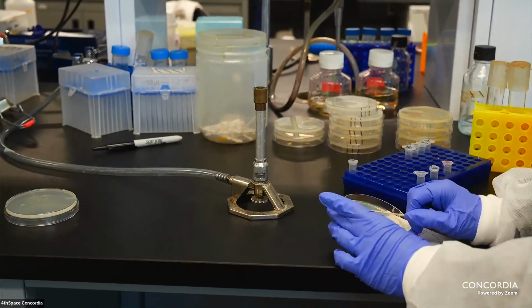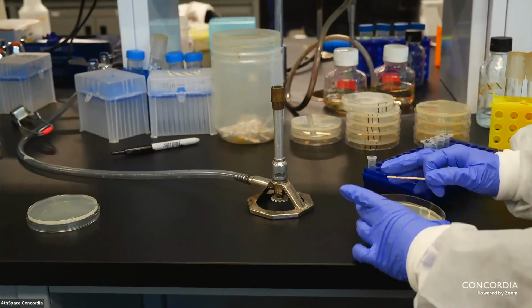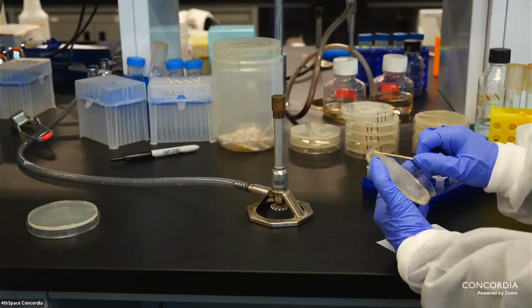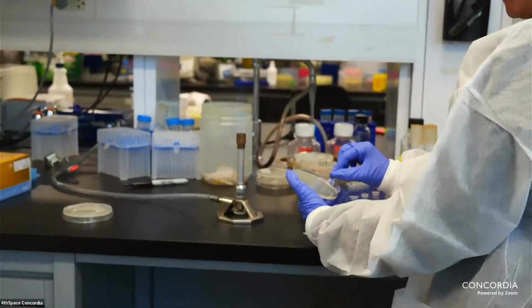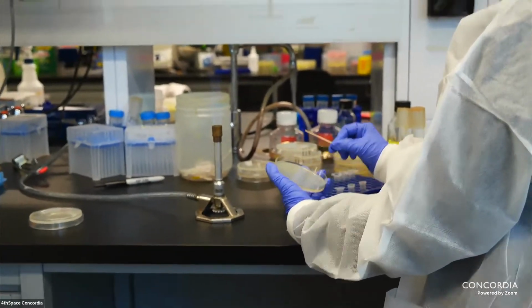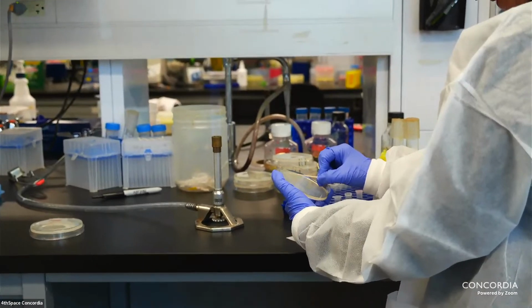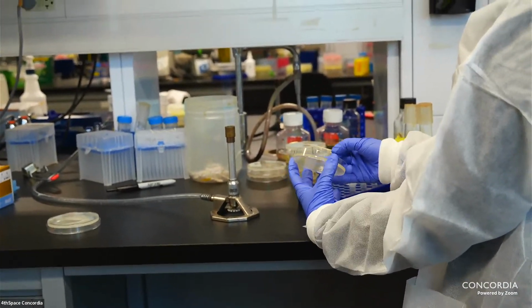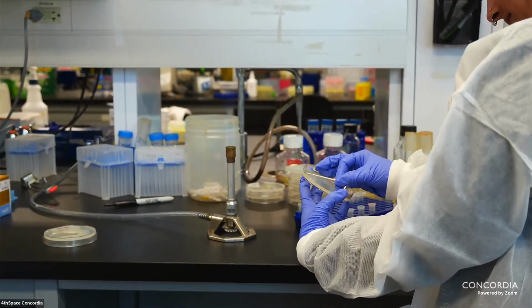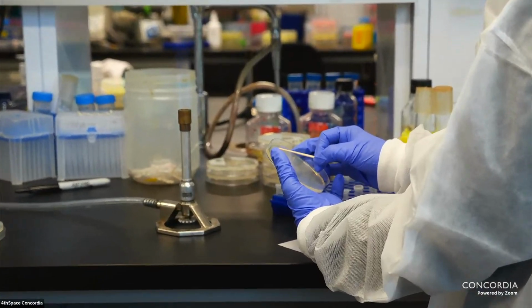Yeah, awesome. Stressful. I know, yeah. No, it's not the camera, it's the flame, honestly. Yeah, I guess after a while you get a little bit more used to working with the flame. There's also, you can work in a sterile hood too.